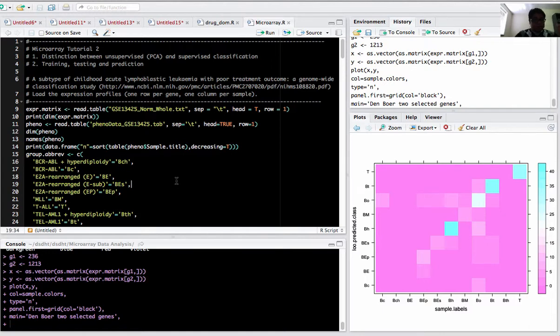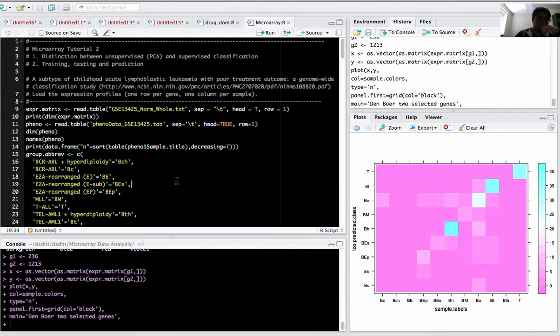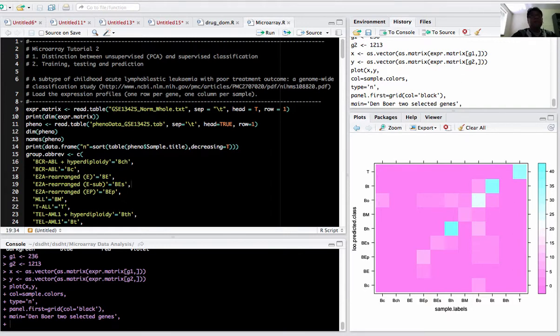Hello everyone, welcome to this tutorial of microarray data analysis, tutorial 2. We'll be showing you techniques of unsupervised and supervised classification systems. For this practical study, we'll be using the acute lymphoblastic leukemia dataset.